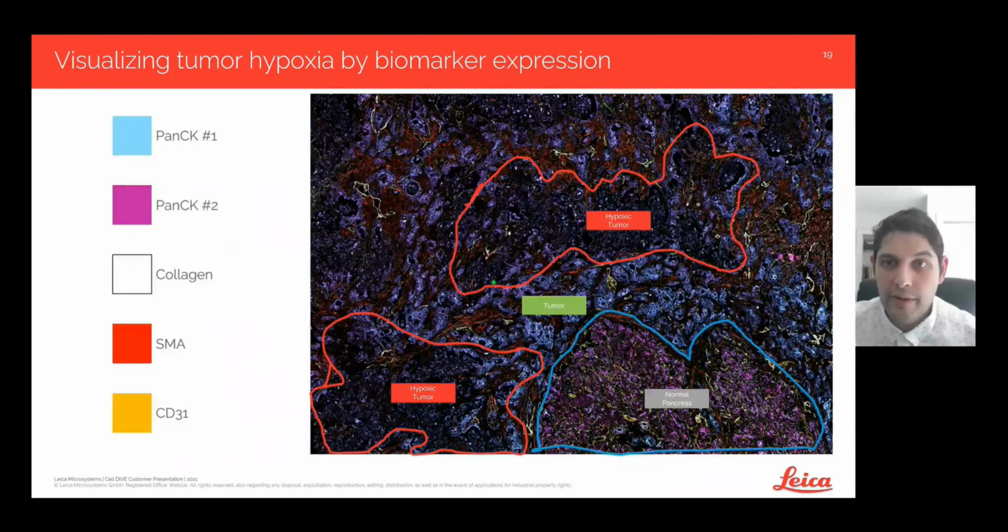Understanding all cells in the tumor microenvironment is essential for improving cancer therapies, especially immunotherapies. Different regions of the tumor, such as the stroma, can behave differently from each other in the context of the disease, and the contributions of these regions may underlie the often quite different responses that patients display when treated with these emerging therapies. Beyond contributions from the stroma, there are subregions within the tumor that adapt to hypoxic conditions and can gain dominance by uncontrolled cell growth.